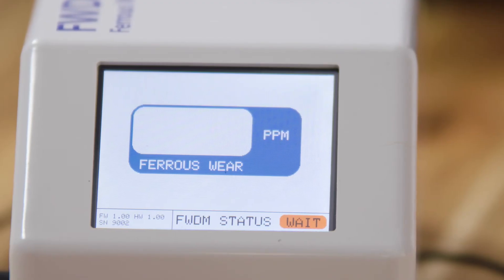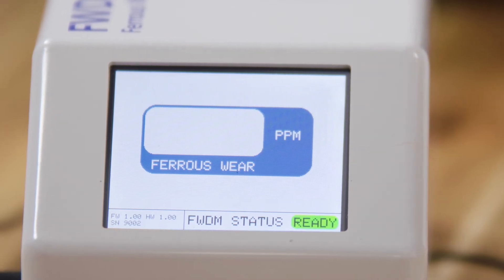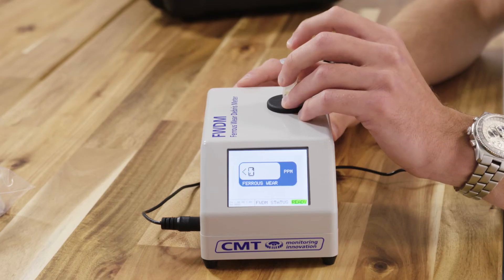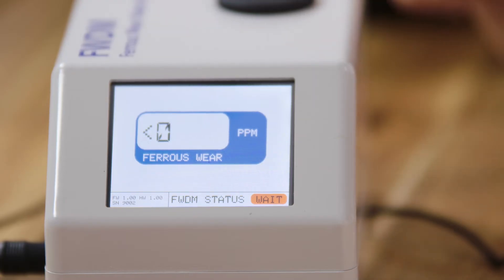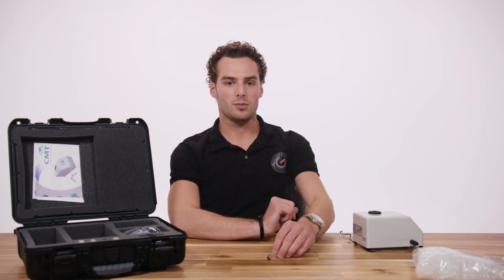After collecting the sample, switch the device on by applying the power. Wait until the device changes from 'wait' in red to 'ready' in green. Drop the sample into the device and make sure it's a real drop, so don't be gentle. The status will change to 'wait' in red. When the measurement is completed, the status will switch to 'pool' in yellow and the result will be displayed on the screen.